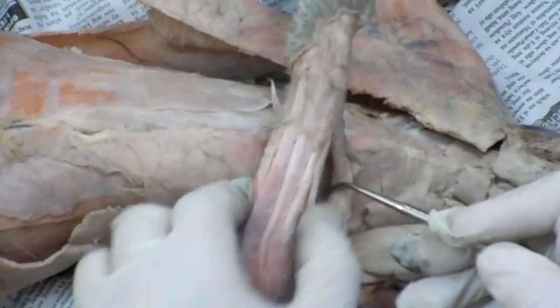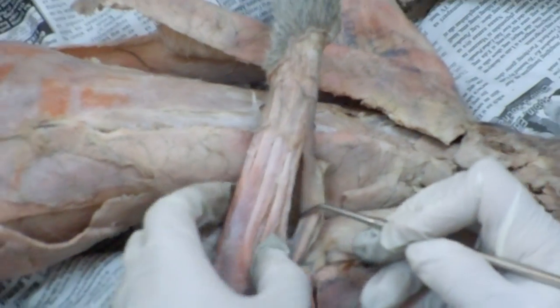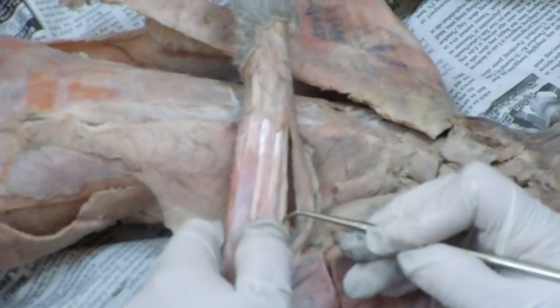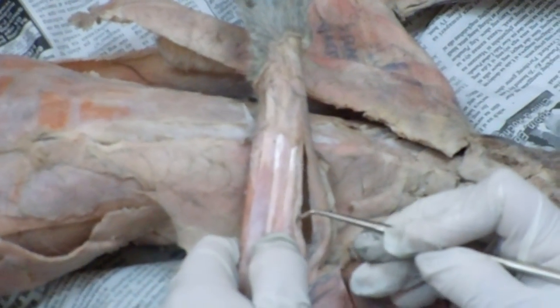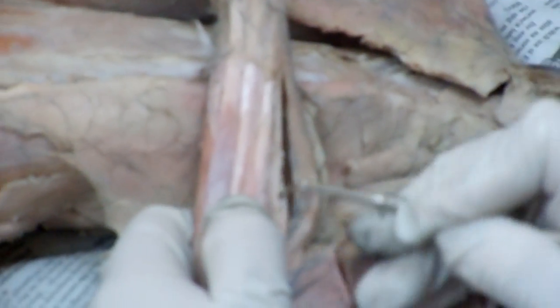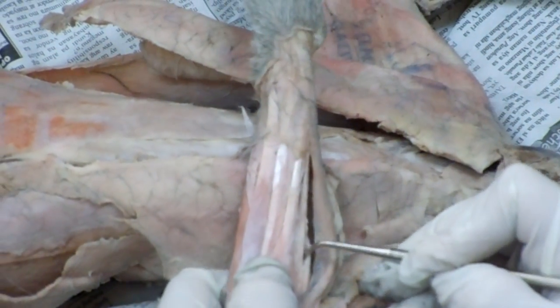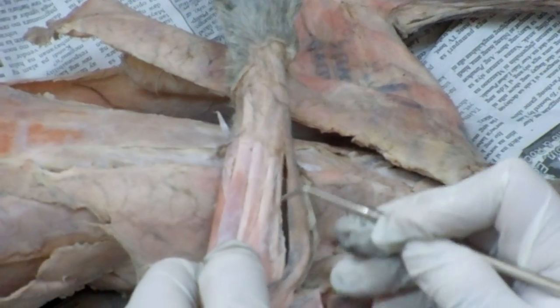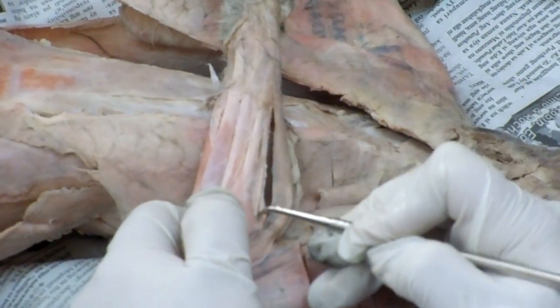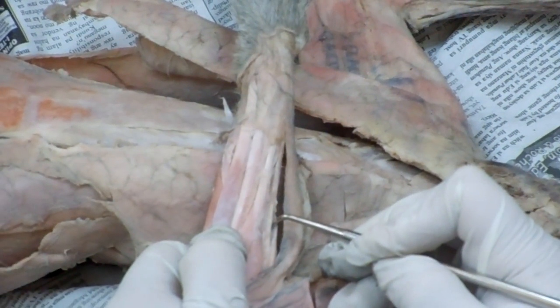Insertion. Ano nga itong muscle na ito? Ito siya. Extensor carpi radialis. Divided siya into two. Shorter one is brevis, longer is longus. So, yung shorter part niya is the brevis. Ito yung brevis, ito yung longus. So, again, ano tong muscle na ito? Extensor carpi radialis. Okay, next.